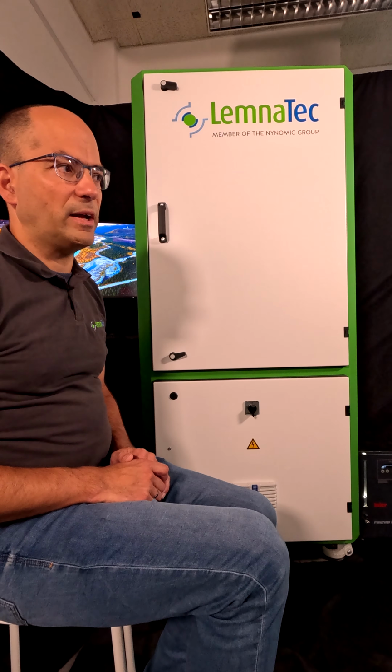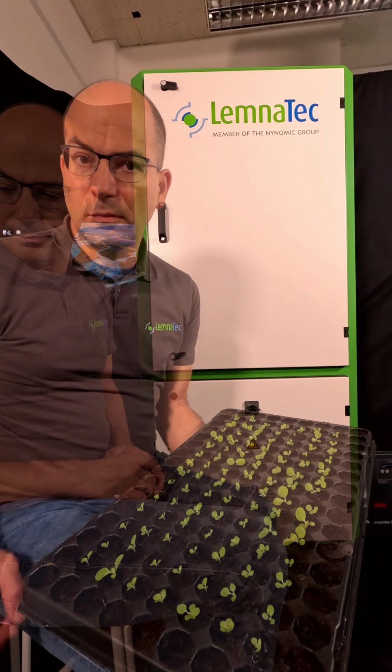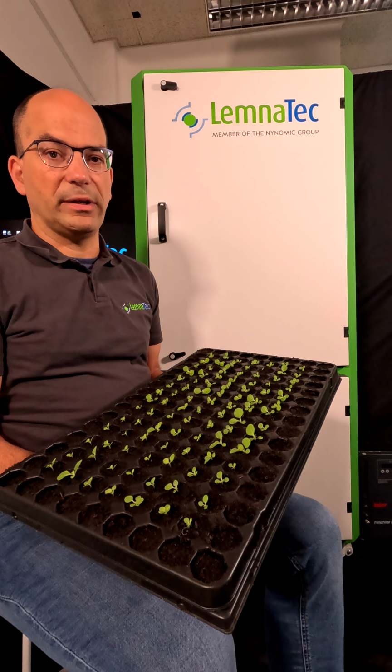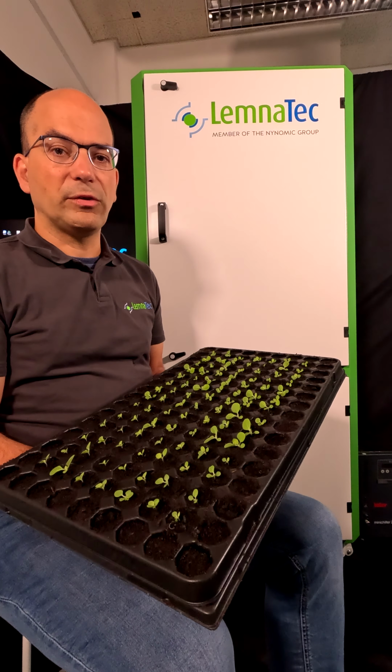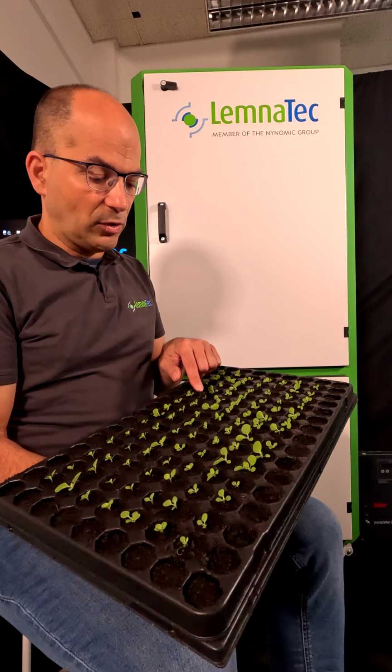This works via the LemnaTec control software that is installed on the computer. When the system and the software are up and running, we can use the system for recording images. As mentioned, it can do classical phenotyping, but it can be also used for monitoring bioluminescence at whole plant level.